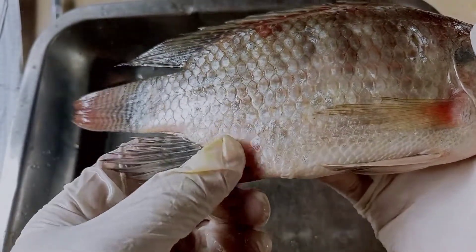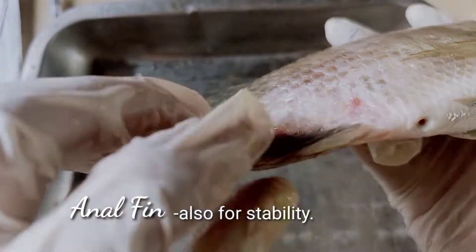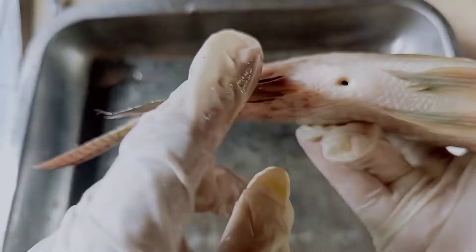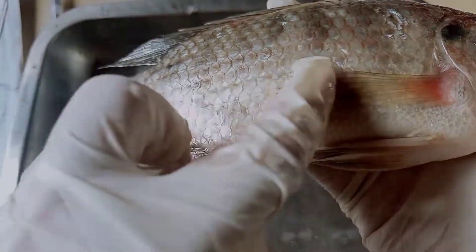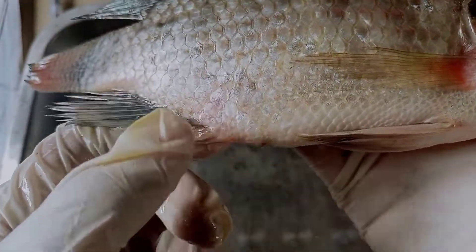And this is their anal fin. It is called the anal fin because it is located near the anus. Similar to the pelvic fin, the anal fin supports and helps stabilize the fish.